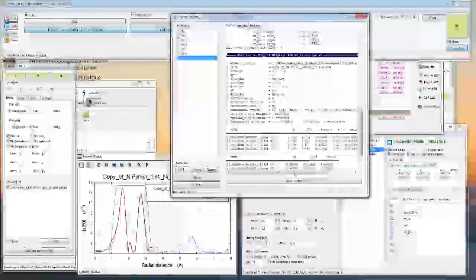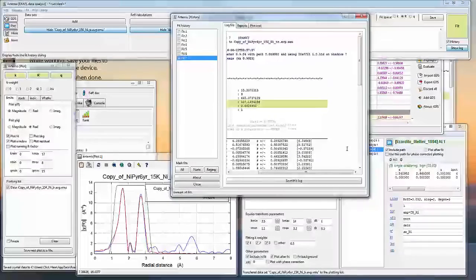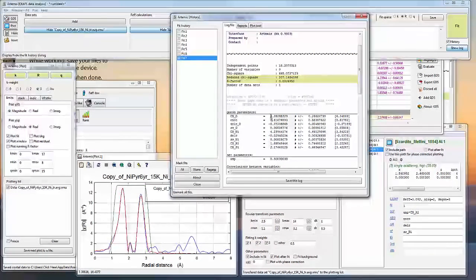If we go down to the bottom, we can see what the determined values are. So we can see here the delta R value is the same for all of them. It's bringing them in a little bit compared to the model at 3.05 and 3.05. I told it these had to be the same, so I assigned this value to be the same. So actually, I think this fit looks pretty good. Chemically, it's got everything that I want in it, and the values are all physically reasonable.